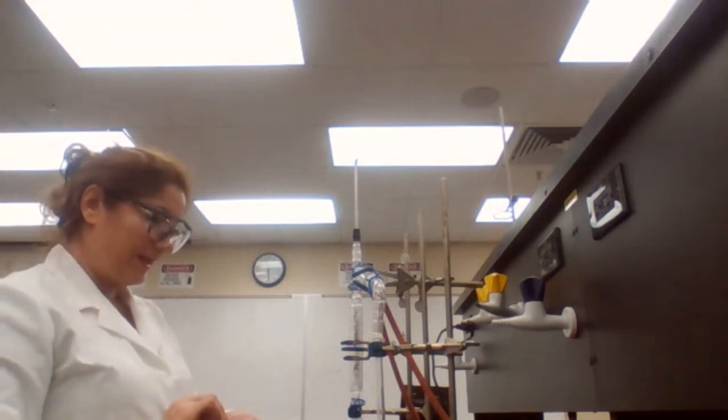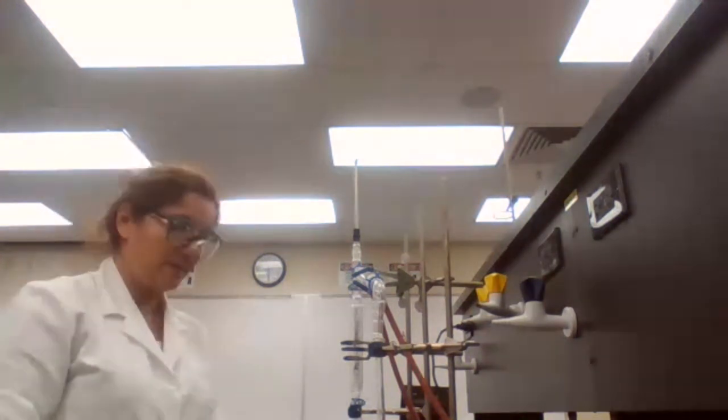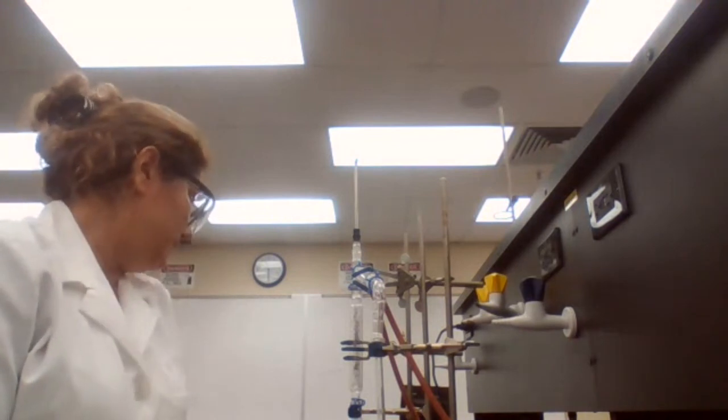Okay, it's going to take a few minutes before we start getting any drops. And while we are waiting for that, I can answer your questions. The barometric pressure, we do have one in the other lab. I will go ahead and read it and come back. I'll give it to you. Sure. Any questions?